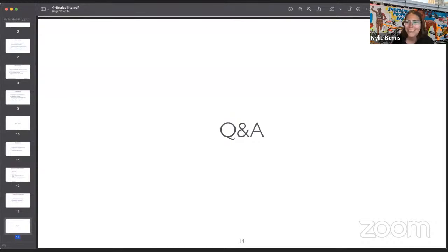Thank you, everyone. I do wish we had more time, and if we were in person, this would have been a whole day, but I try to cover as much content as I can. I realize that means a bit more shallow coverage of some of these topics, but I hope the R Markdown documents can be useful.